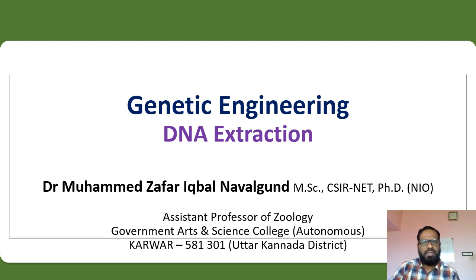In this video on genetic engineering, in the first video we are going to discuss DNA extraction. This is the first very important step, necessary in all genetic engineering experiments. Today we are going to discuss the extraction of DNA from animal cells as well as from bacterial cells.